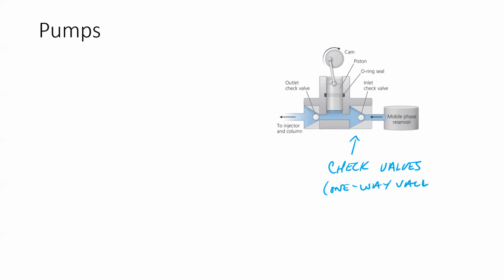We think about them as one-way valves. Right? And so the pump here, this part here is really our pump in the dark color. That's really our pump.